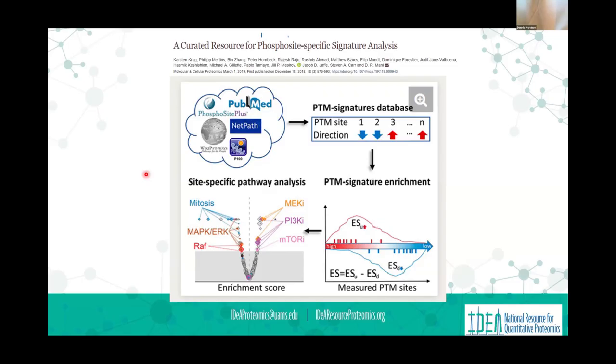The combination of phosphopeptides and DIA is growing, and the analysis software is a little lacking. So we're able to generate similar numbers faster for phosphorylation, but the analysis software is not quite as good.